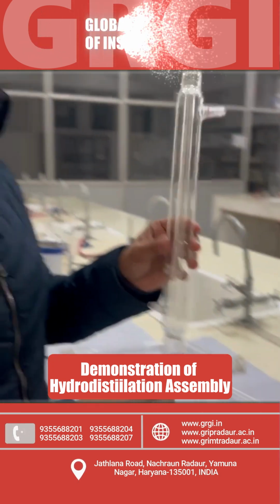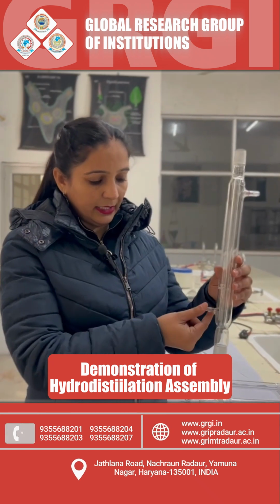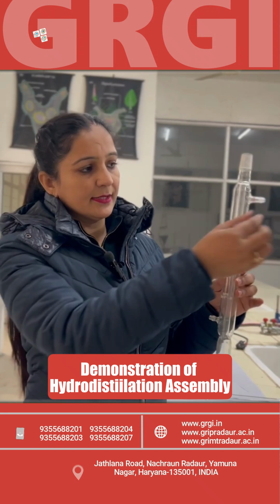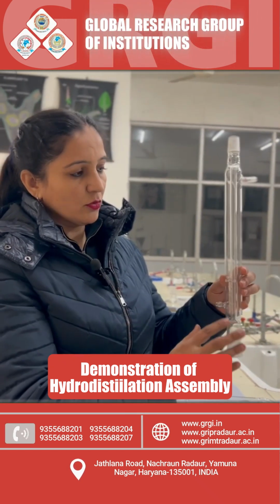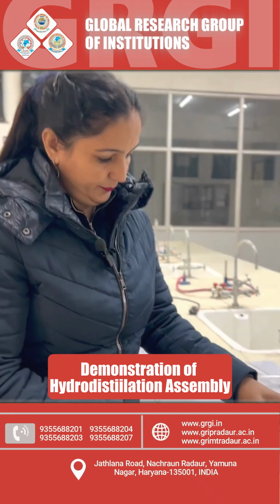Next part is the condenser. In this we need to remember that the inlet of water is from the beneath of this condenser and the outlet should be from the top of this condenser, just to maintain the continuous level of water inside the condenser.